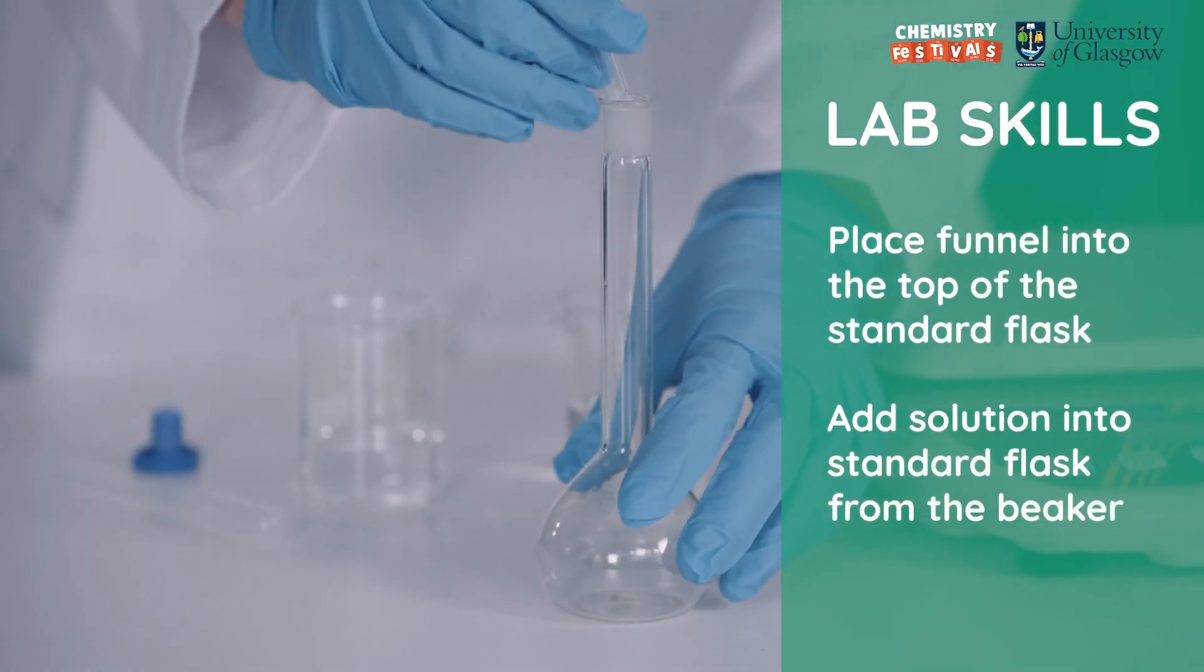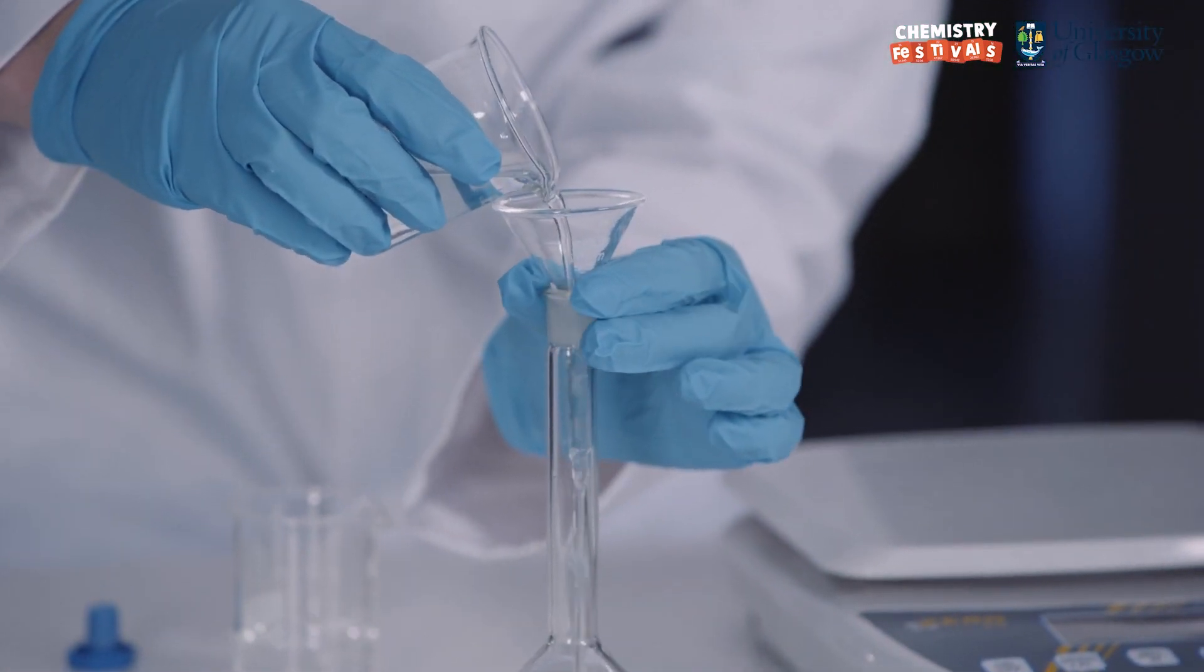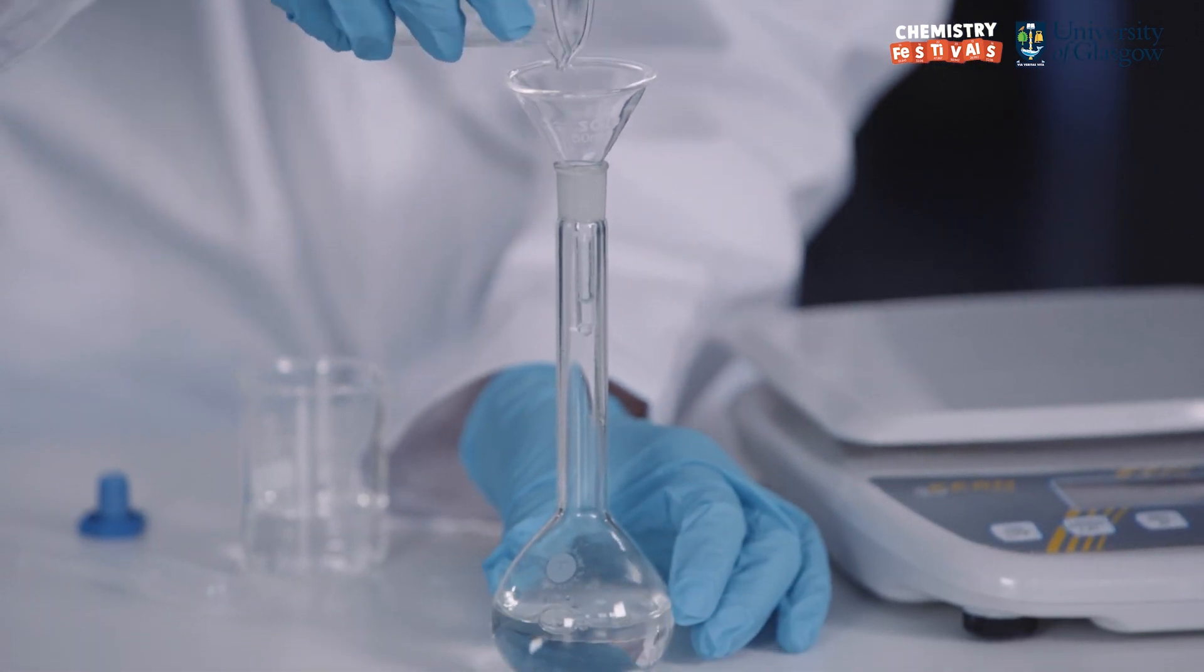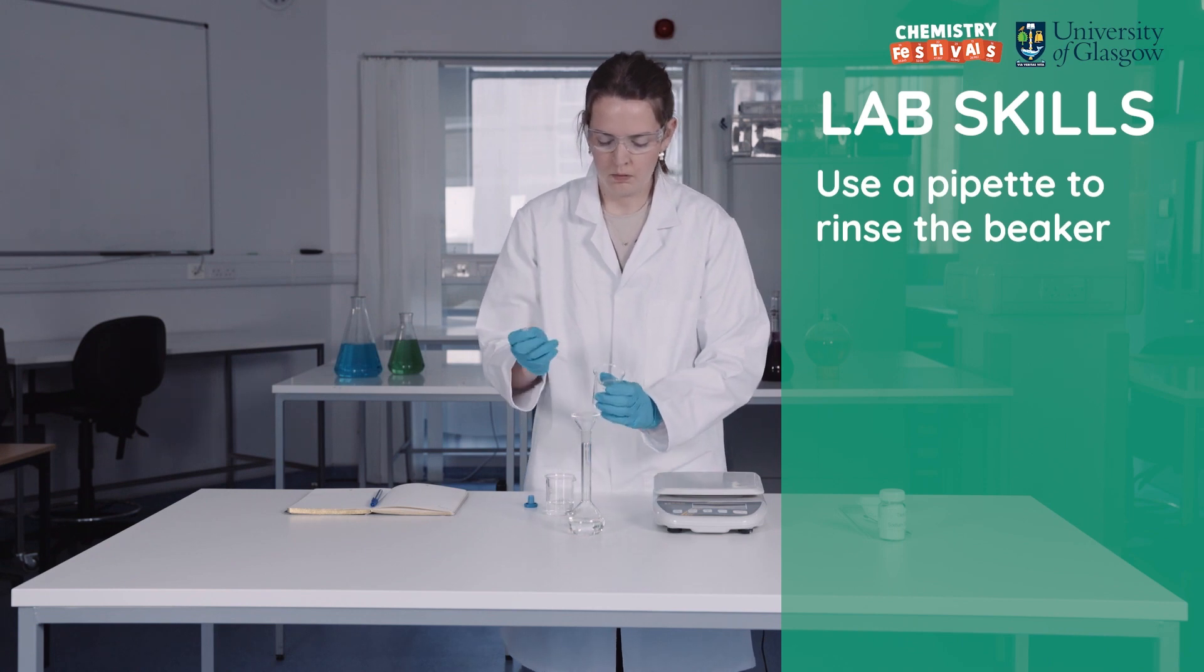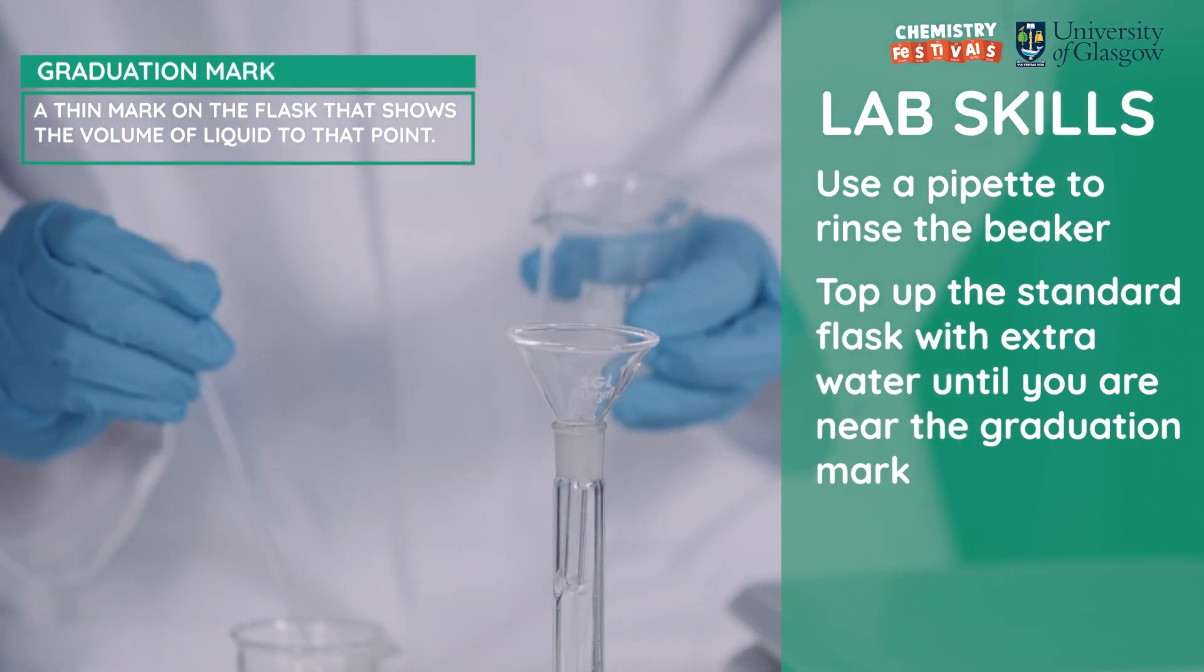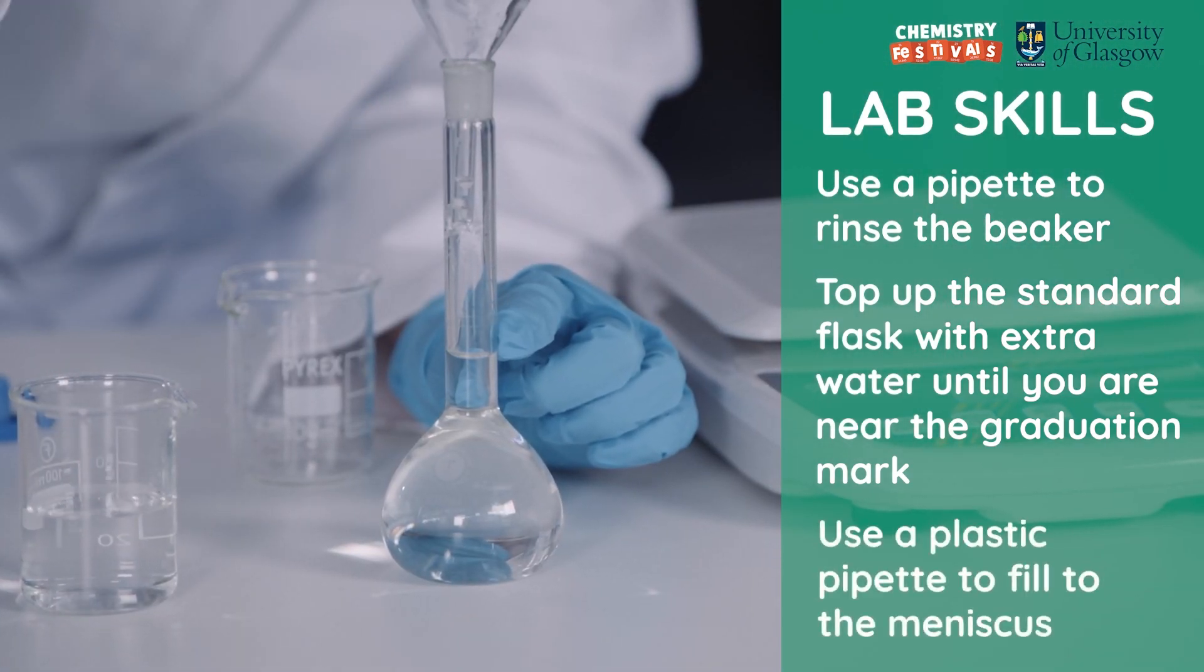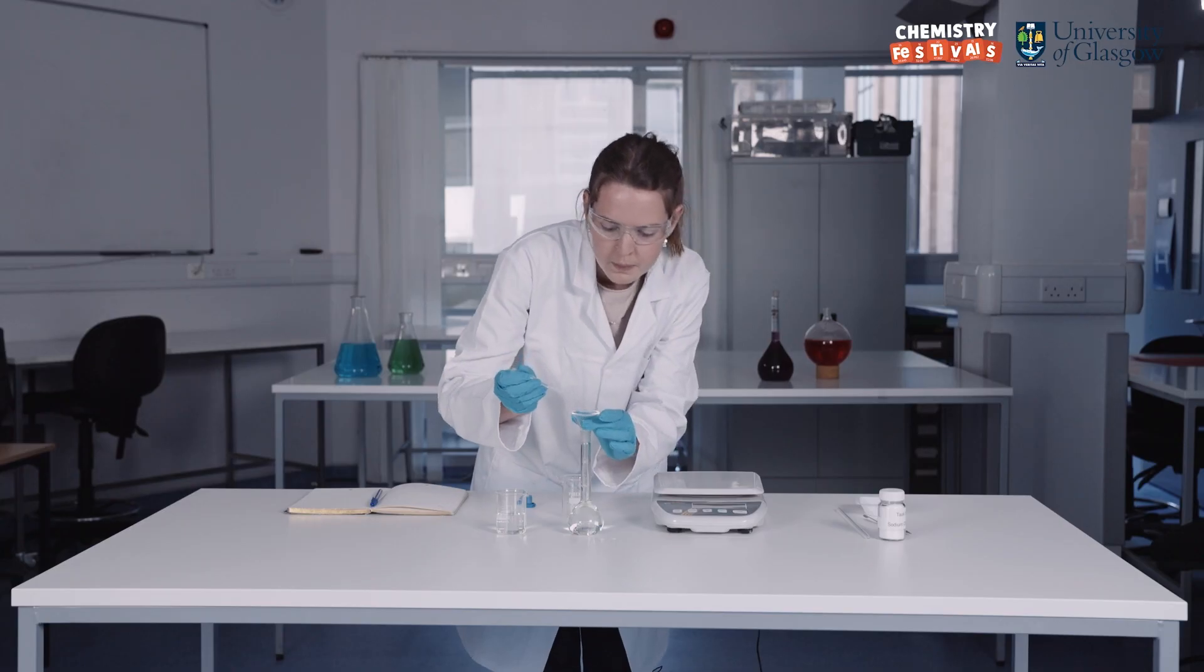Next I will put the funnel into the standard flask and add the solution from the beaker. Rinse the beaker using a pipette to make sure there's no chemical left. Top up with extra water until you are near the graduation mark. Then use a plastic pipette to fill to the meniscus. The meniscus is the bottom of the curve of the solution in the standard flask.